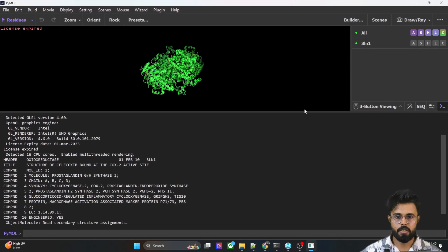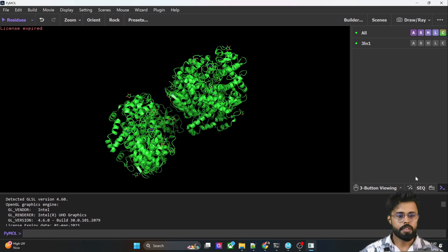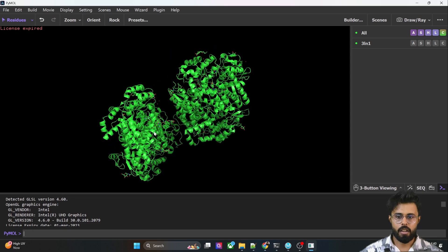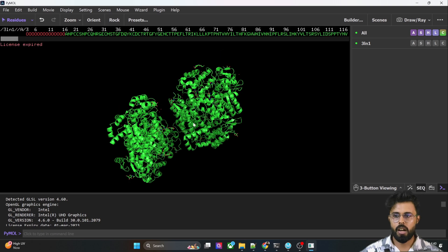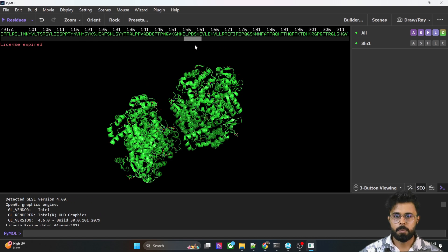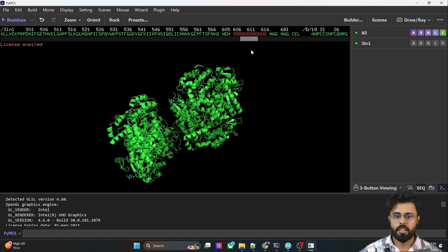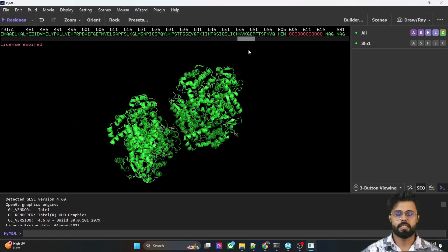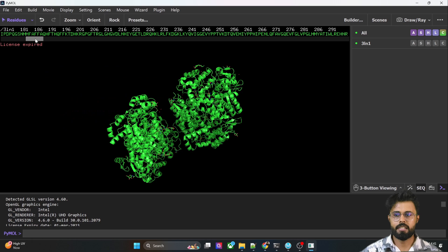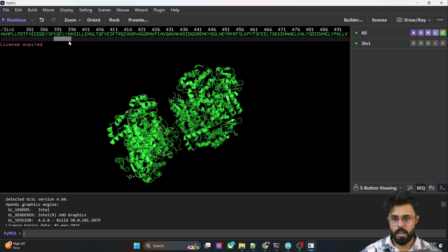You can see the structure in PyMOL. When you click the sequence option, it will show all the sequences of this particular protein. You can see there are many chains — B chain, A chain, C chain, D chain, and others. We are going to take only one chain.